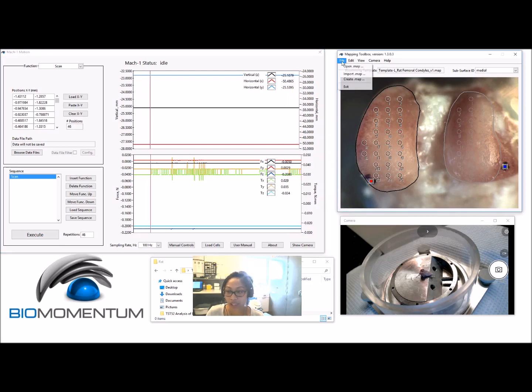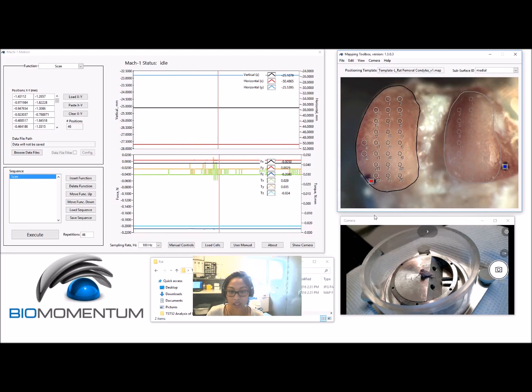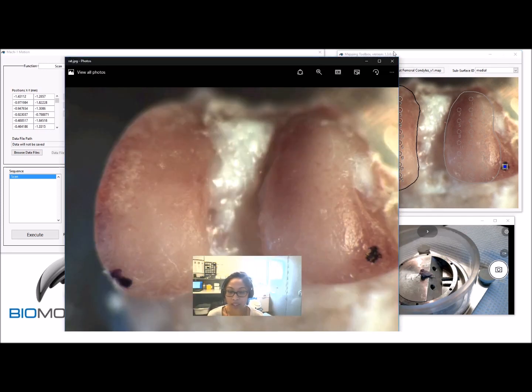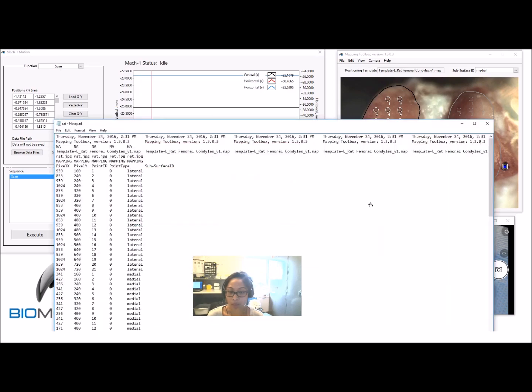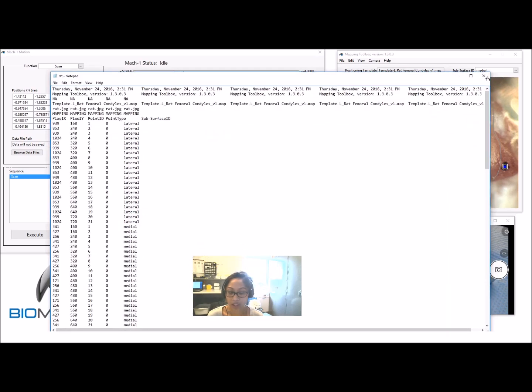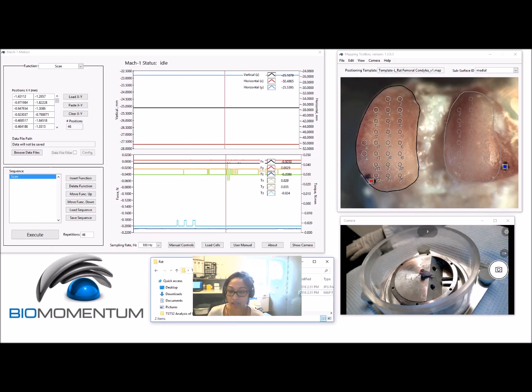To create a blank map file, choose Create Map. A snapshot image of the camera feed will be saved, along with all positions, boundaries, and references displayed in the camera feed, which will be saved in the map file.